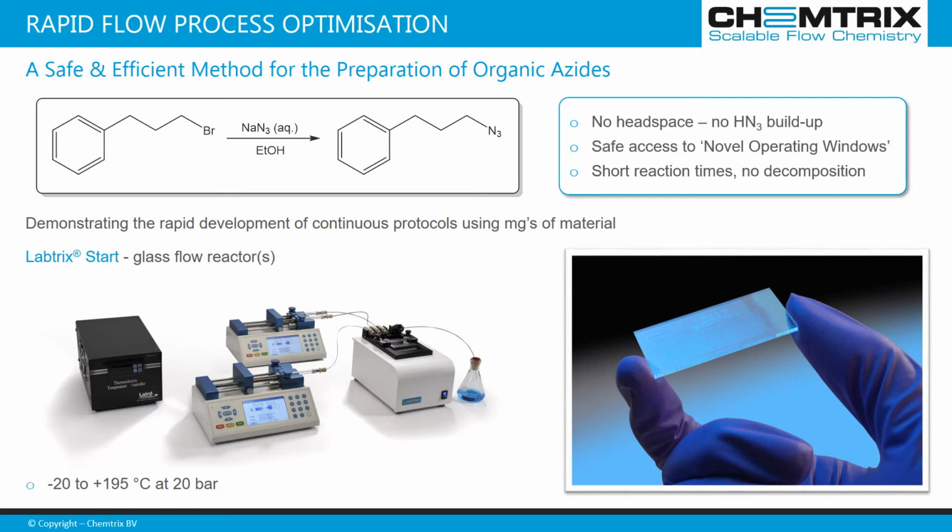So to do this, we're using these small glass reactors that you can see on the right hand side, and in these we're able to preheat the feed solutions, mix, give sufficient reaction time, and if necessary quench, but in this case with the online analytics we don't need to do that.